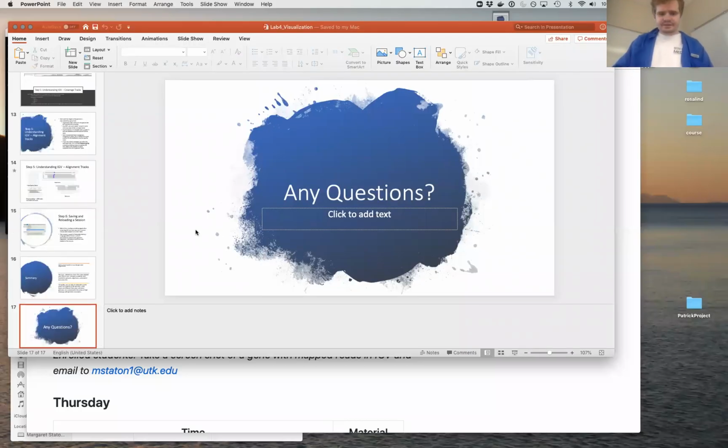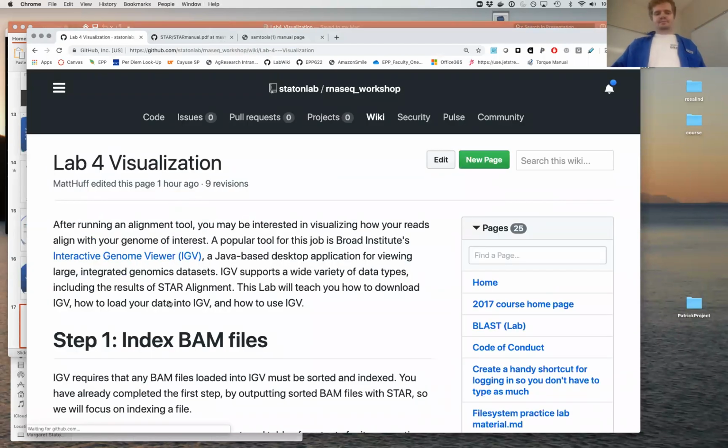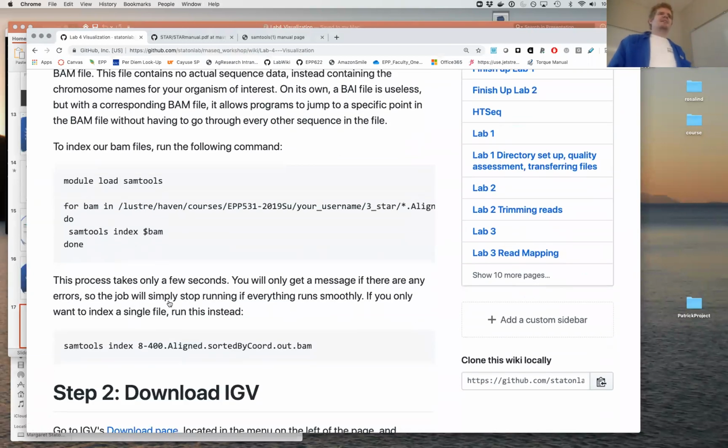So now that I've gone over everything, we're going to go over everything again. And this time I'll walk you through it. So I've run SAMtools indexing on the login server without any issue. So if you don't want to do the qsub, it shouldn't cause any problems. But if it does, then I'll take the blame for that because I told you all to do that.